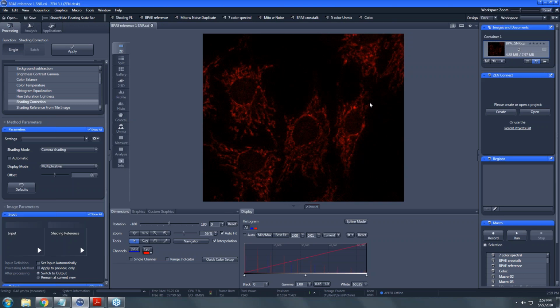If you have something that is distinct in its shape of the curve, then you should be just fine with a 20 nanometer, even 40 nanometer bandpass. As you get smaller and smaller, here's the trade-off also. Your signal to noise is reduced. And signal to noise can be an issue with spectral when you get very, very small spectral windows, because you're of course eliminating most of the photons from that channel. You don't really have much data left if you really make it small.